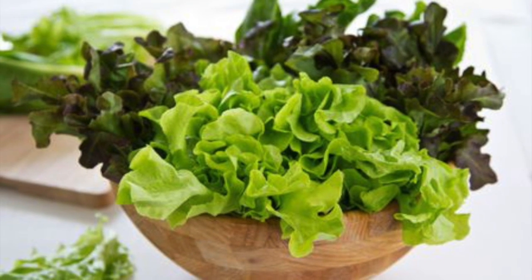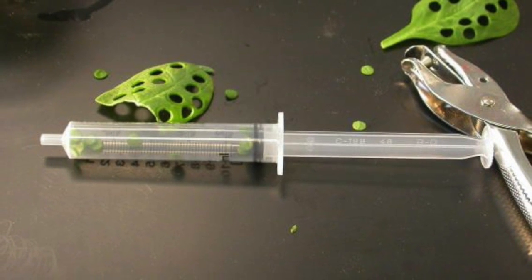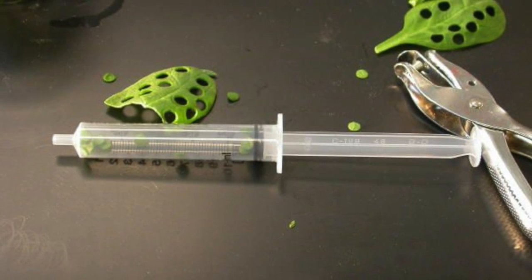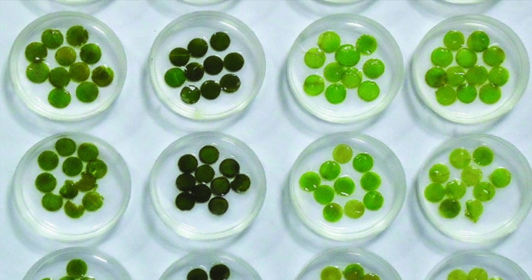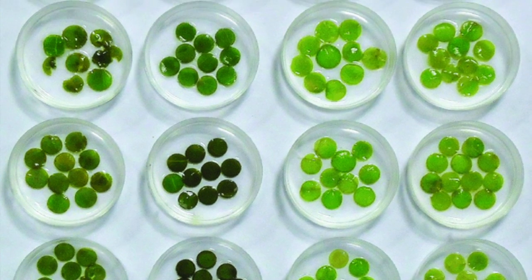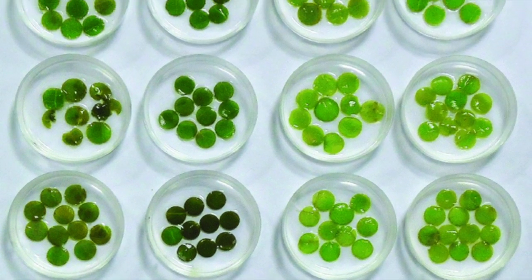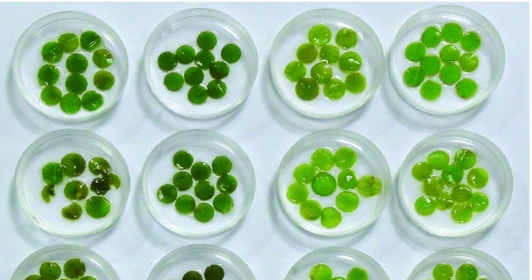In addition to this, only 5 leaf discs were used in the experiment. If the lab were to be replicated, a larger amount of leaf discs would produce more accurate results. It would also be beneficial to have extra leaf discs just in case some do not initially float, ensuring that there is a larger sample size.